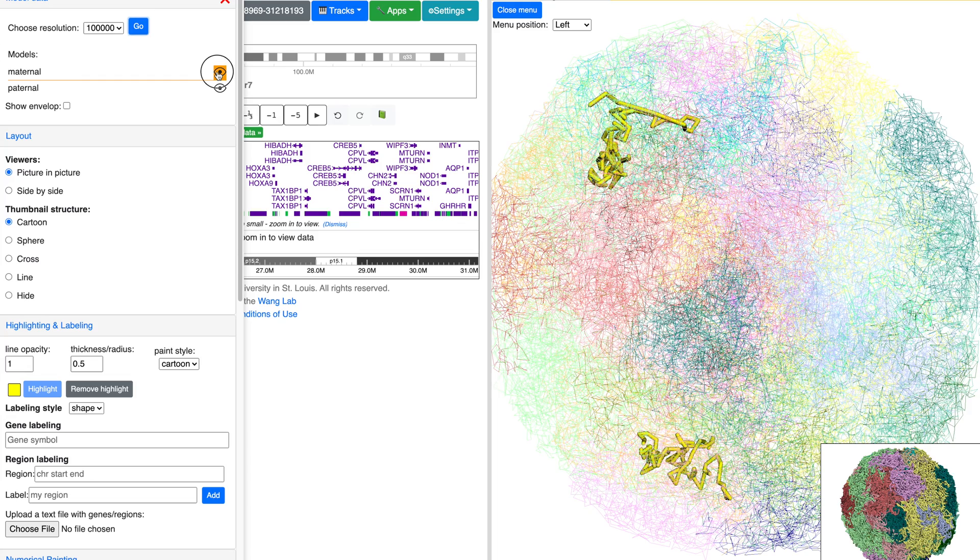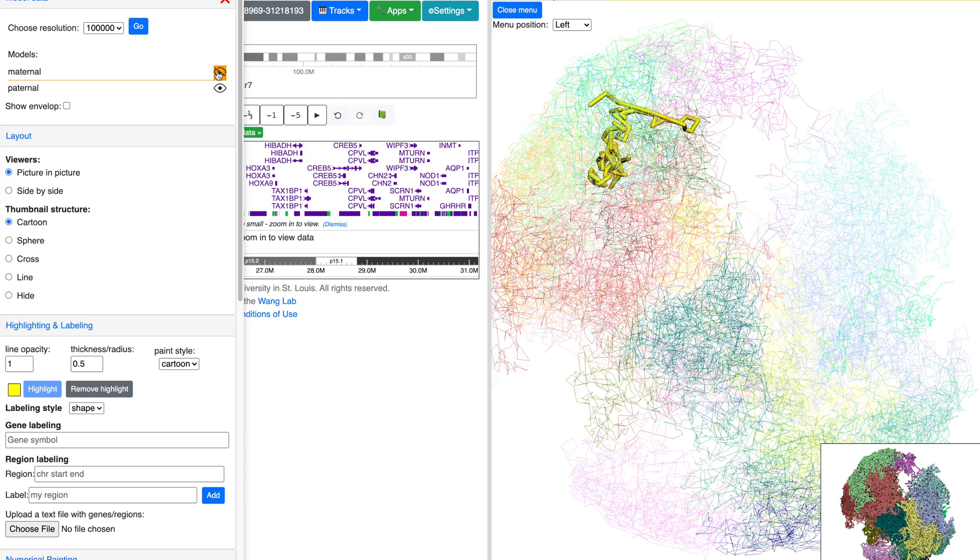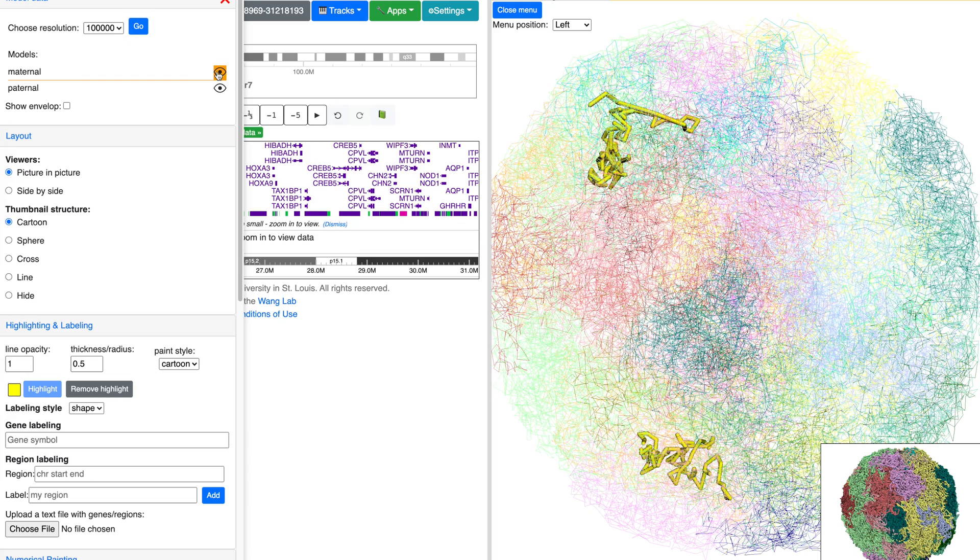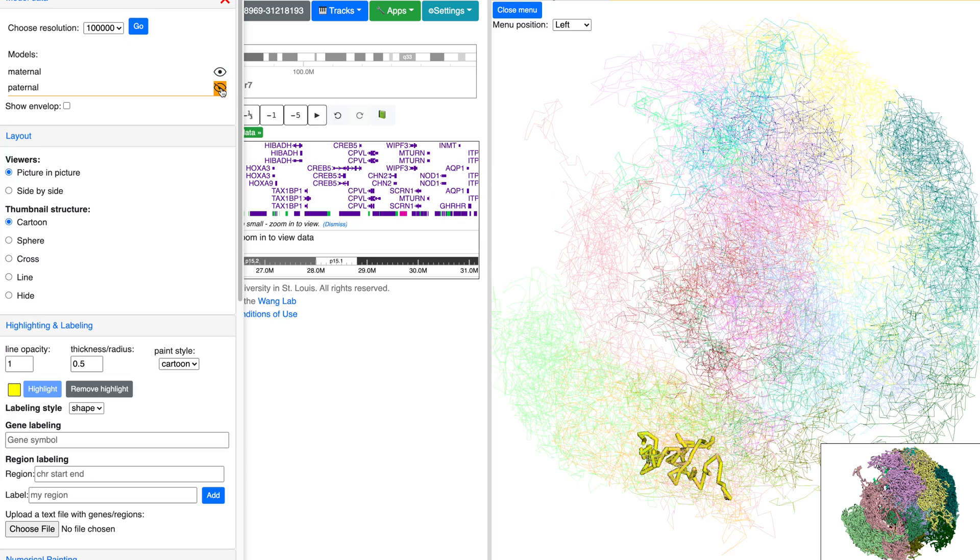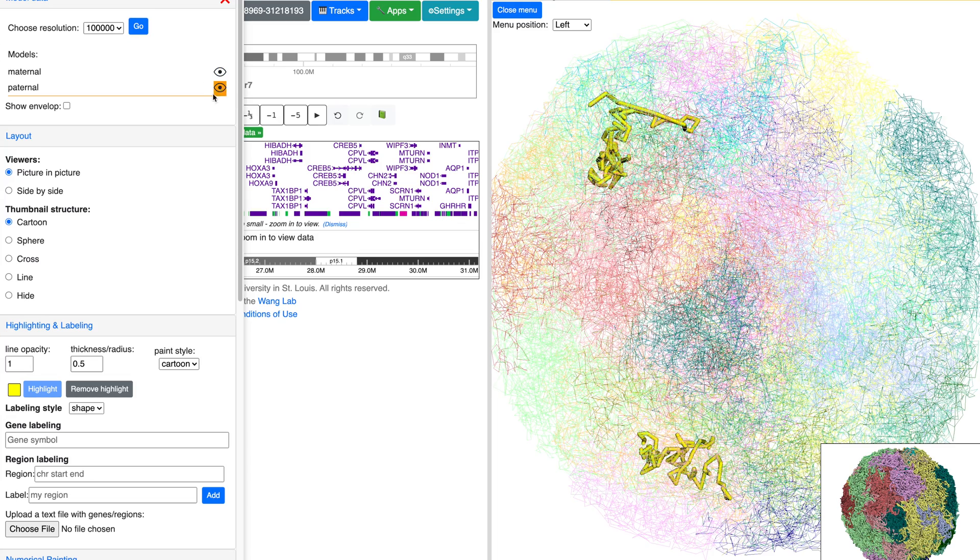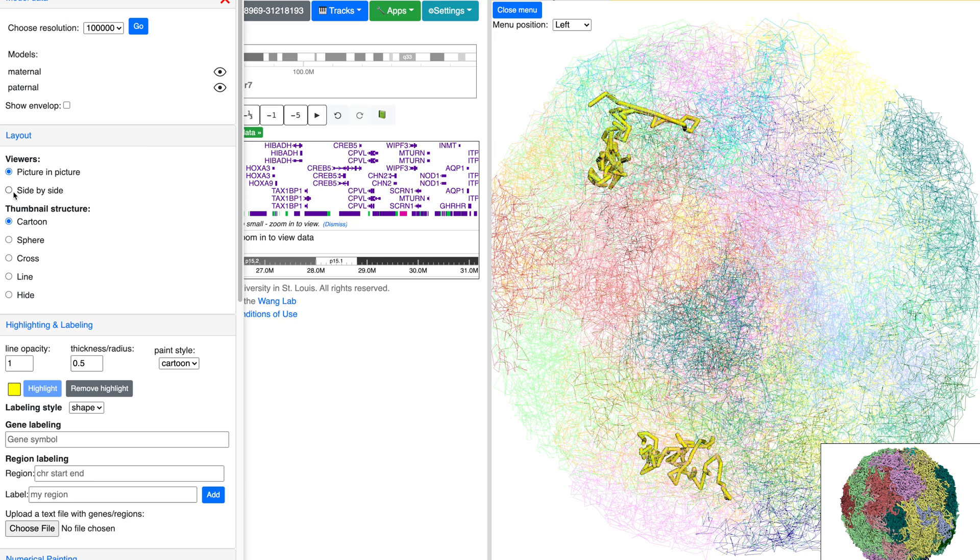To toggle between models, hit the eye figure to turn the maternal or paternal off.